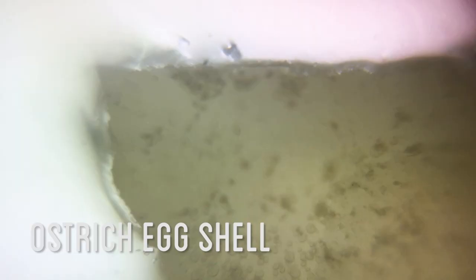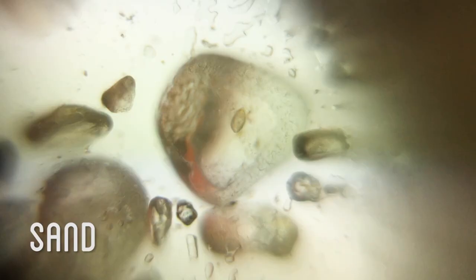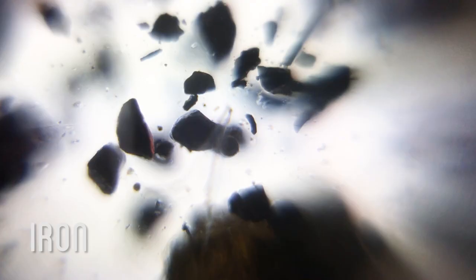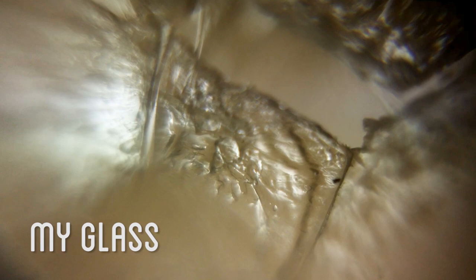XZXY101X suggested checking out my eggshells, so I did that with both the chicken shells and the ostrich eggshells. I also checked some of the sand I used, which actually looks almost transparent this close-up. Next I checked some of the iron I removed from the sand with a magnet, and lastly here's a close-up of a piece of glass I made in my first attempt at eyeglasses.